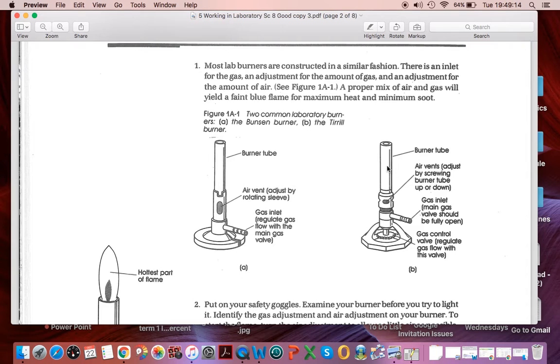On top is something called a burner tube, and the burner tube controls the amount of air getting in, which means it controls the amount of oxygen getting into our flame. So when we light it, we want this at the bottom open about five full turns, and we want the burner tube closed. When it lights up, it should light up orange, and then we want to get a hotter blue flame that will have an inner cone, and we do that by opening up the burner tube.